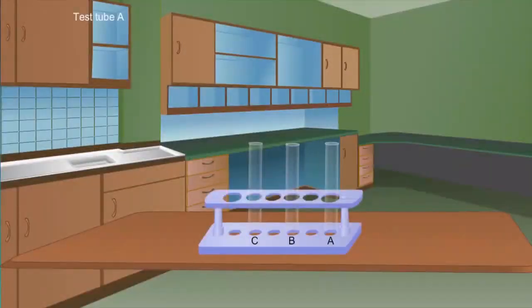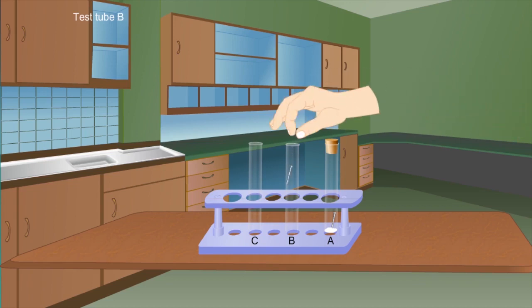So what we will do is place the brightly polished iron nail along with fused calcium chloride in the test tube A and plug it with the help of a cork. So this will be our test tube A. The fused calcium chloride keeps the air in the test tube dry as it absorbs all the moisture from the air. So here we do not have moisture.